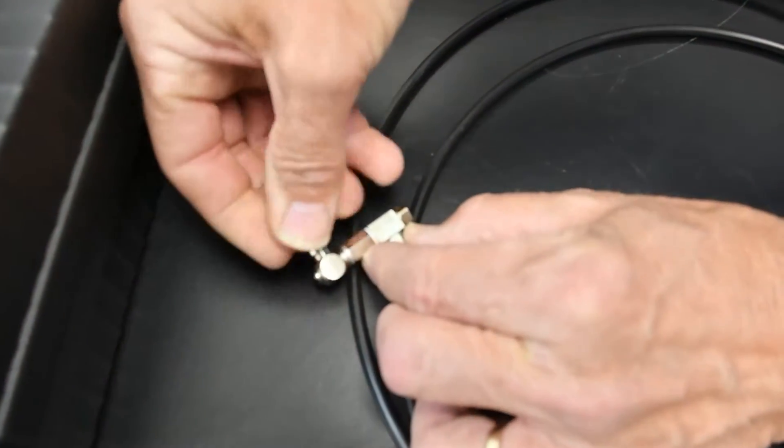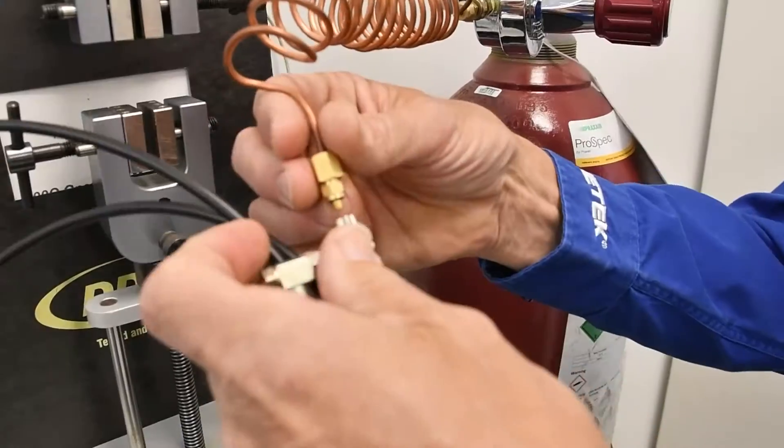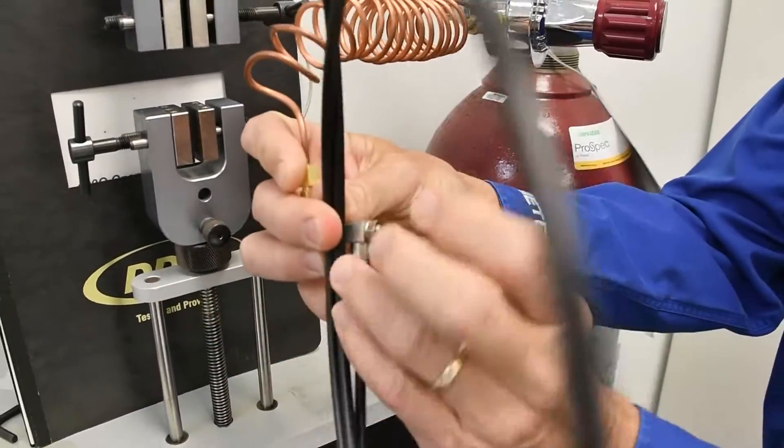Remove the plastic fitting from the pressure relief kit. Install the pressure relief kit onto the nut, ferrule, and copper tubing.